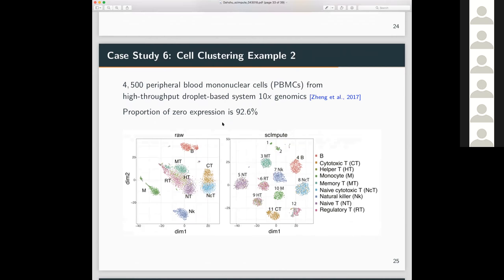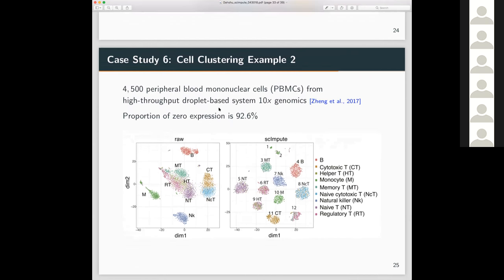And so for scImpute, it seems very important to find all those neighbors, because you impute based on the distribution of genes of all its neighbor cells. So is scImpute sensitive to the number of clusters, like the k, and how to set the k in real practice?